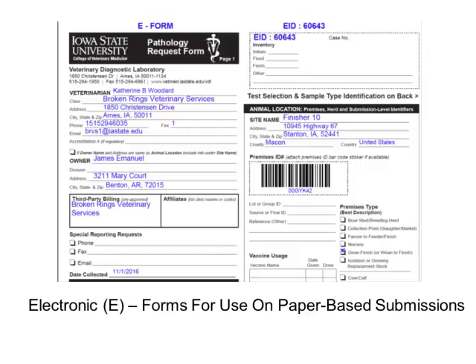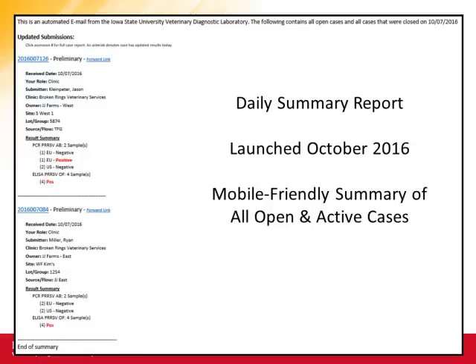And then we just type in that number and it pulls up all the information from what the submitter had submitted online. We also have something that we call an e-form, for situations where this web thing just isn't going to work for me because I don't have all the information in front of me that I need to fill out the total form. With these e-forms, people generate all the farm level information on the web. They print this out, and then they fill in the additional information about the farm and the samples themselves. But again, we capture the benefit of being able to capture that electronically.